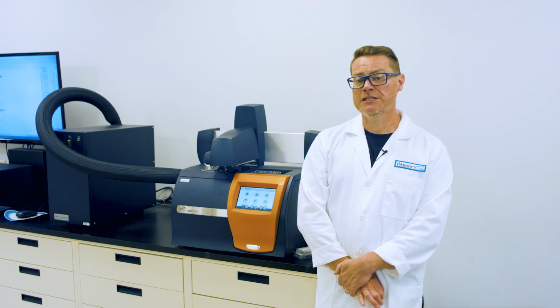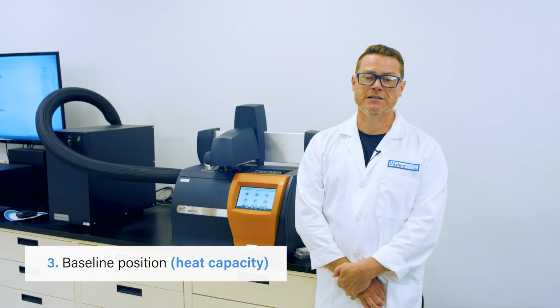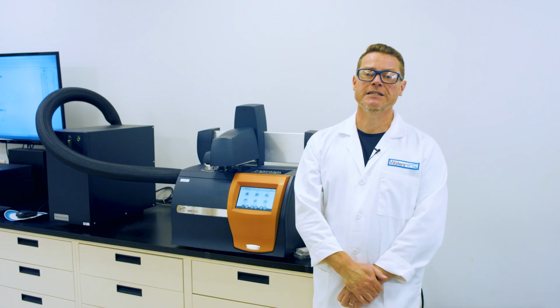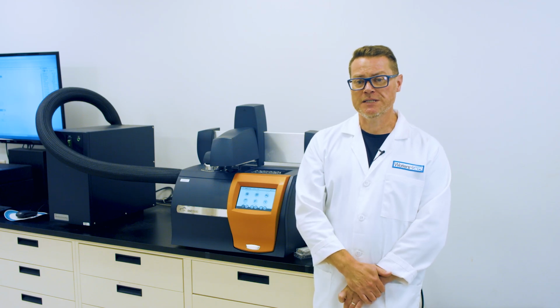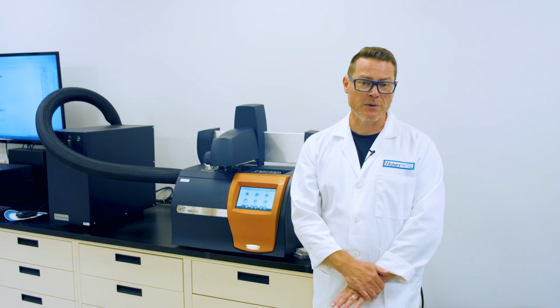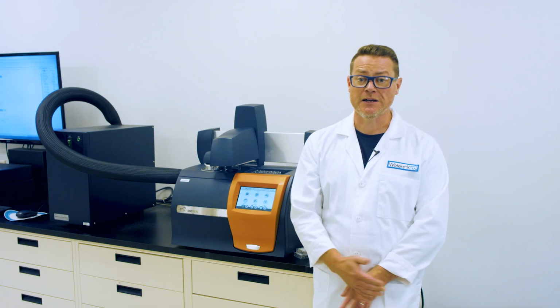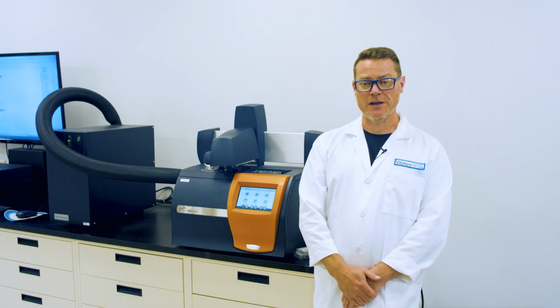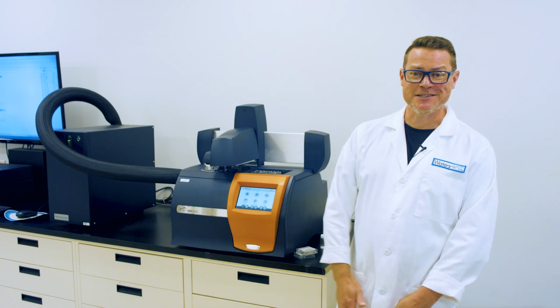Finally, the position of the baseline tells us something about the heat capacity of our sample. Heat capacity, you may remember, is the amount of energy required to raise a material in temperature. It affects the position of the baseline because the y-axis values are the difference in power needed to change the temperature of the sample and reference materials. And the higher the heat capacity of one of those, the greater the difference in power supplied. And that, in essence, is all DSC is.